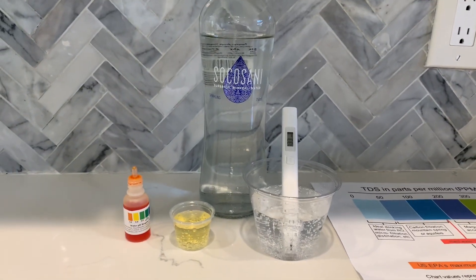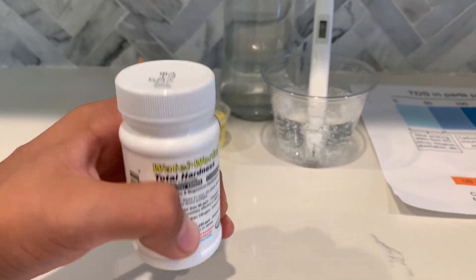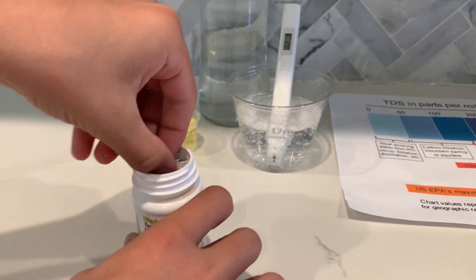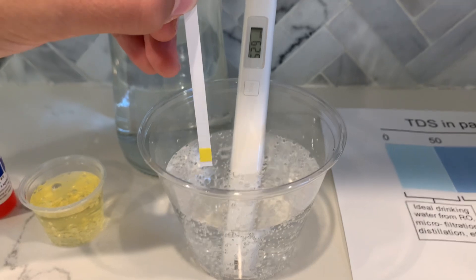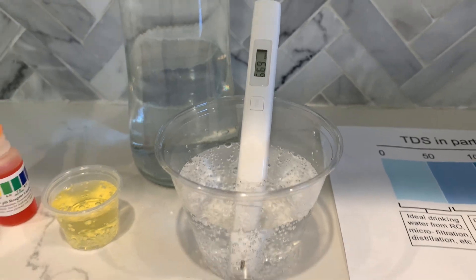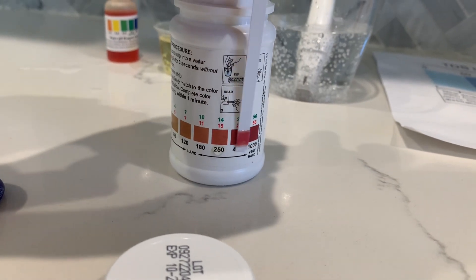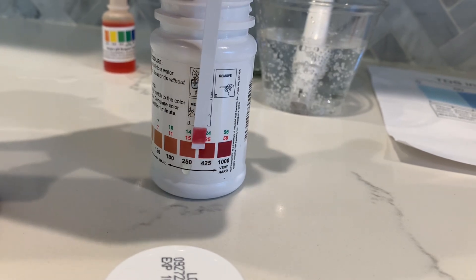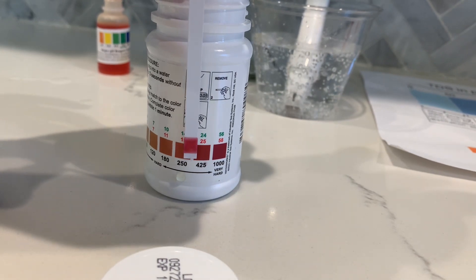Now, let's test the total hardness of the water. We will use WaterWorks total hardness tester. Let's take out one strip and put it in the water for three seconds without motion. Now, let's compare it to the chart. I'd say it's in between 250 and 425, which is hard water.